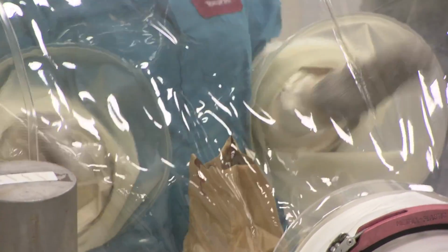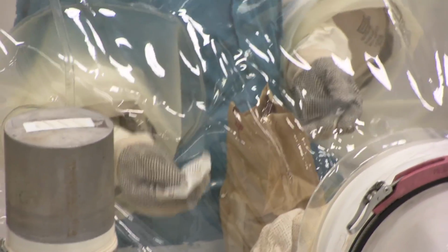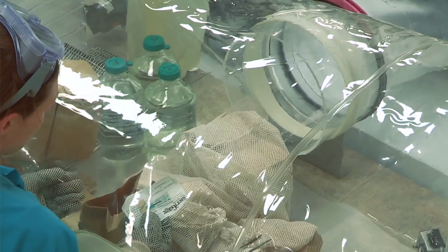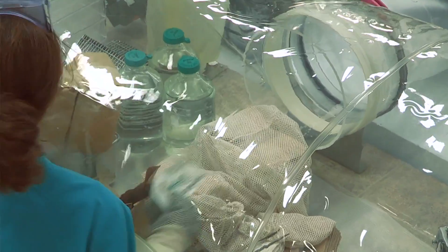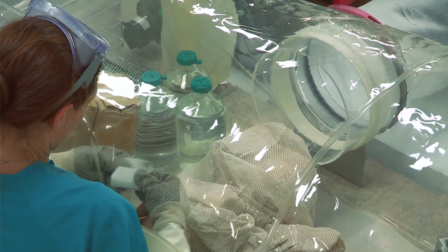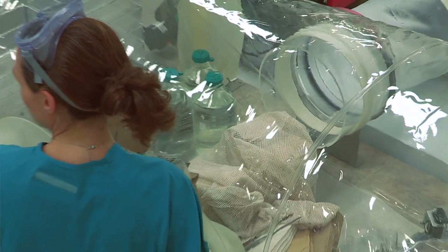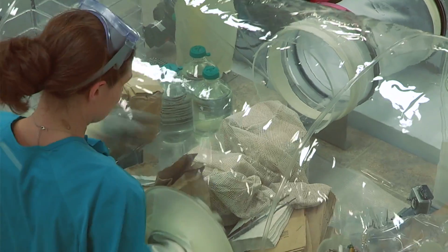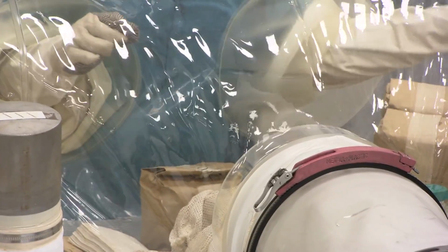If it was reject, you'd want to take all of the supplies that were just entered in from your cylinder and immediately exit them back out of the isolator. If this was rejected, there is a chance that your isolator was compromised, so we would place the isolator on detainment, which would usually mean no sale of animals, until we've made sure that there's no new contaminants identified. So once everything's acceptable, we can go ahead and put our supplies away.